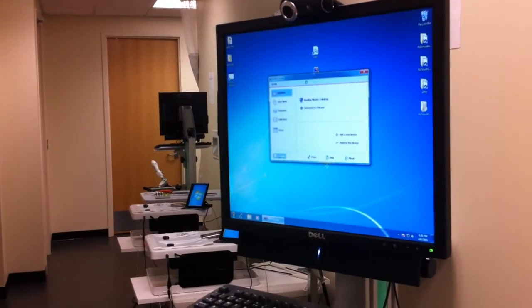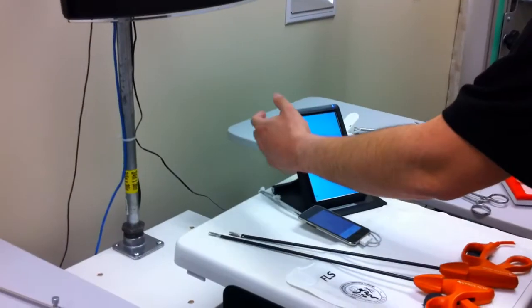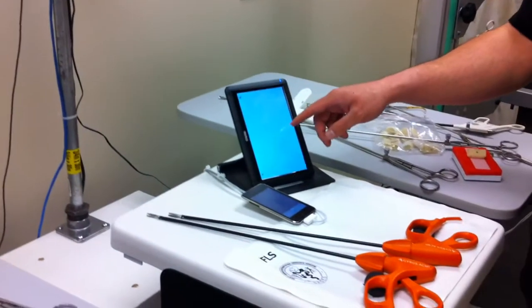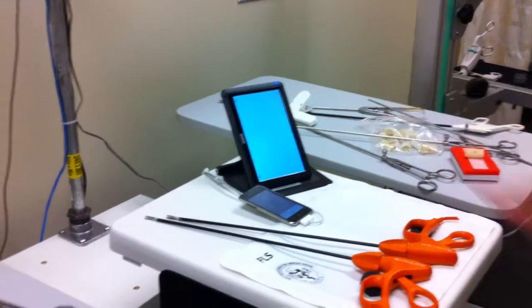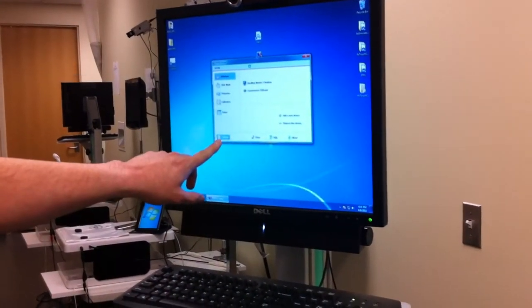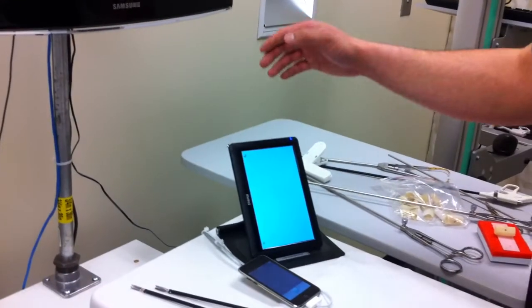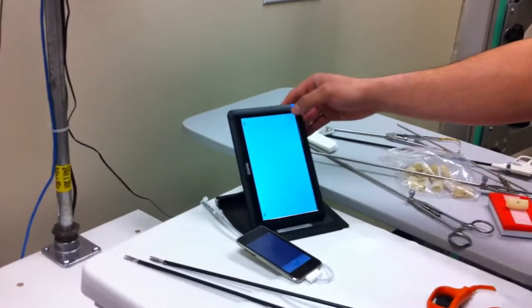I'm going to press calibrate, just to confirm that it's that one down there. I know it's this one. And again, we got lucky because the calibration screen is here. I'm going to go back and press escape really quick because I don't think I touched the crosshair correctly. And now I'm going to press calibrate one more time. The calibration screen is going to show, and now I just walk through and press each crosshair.